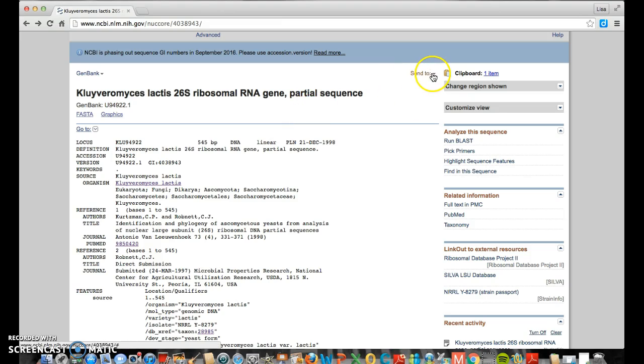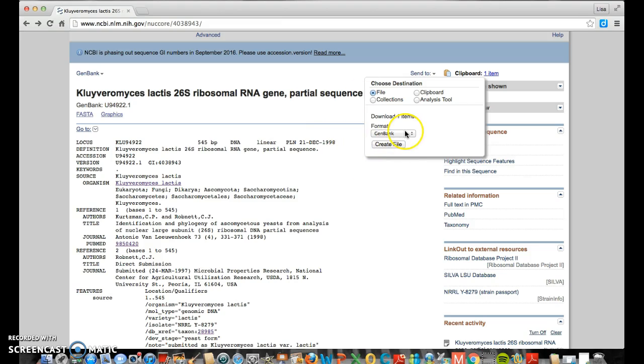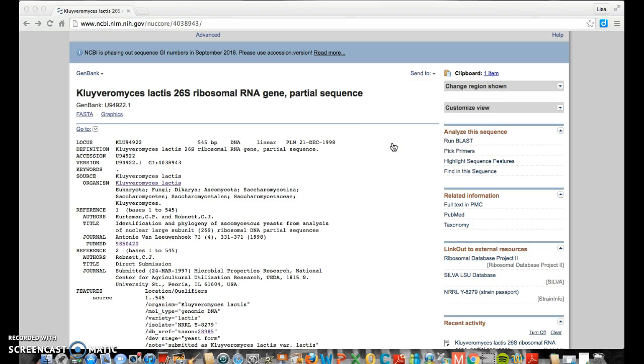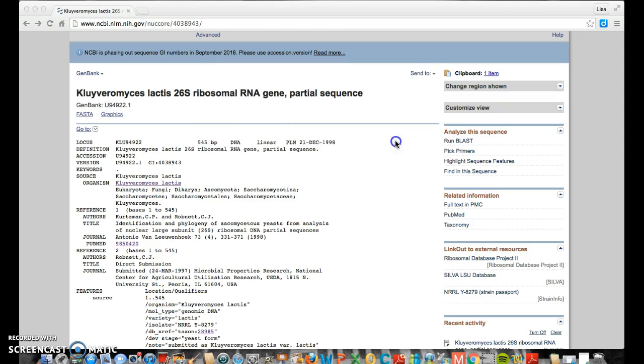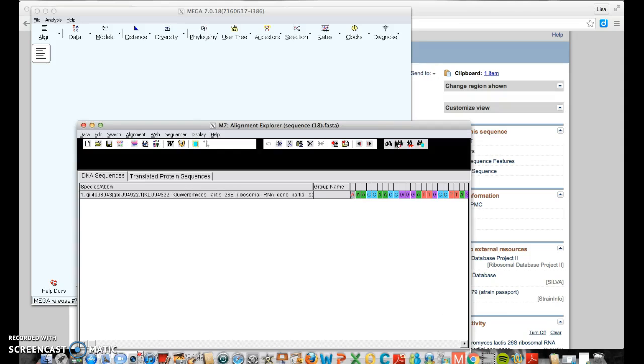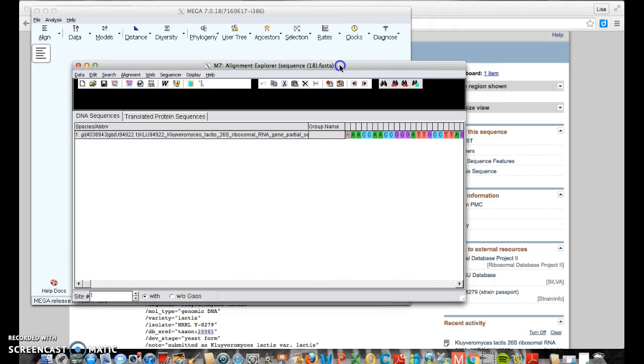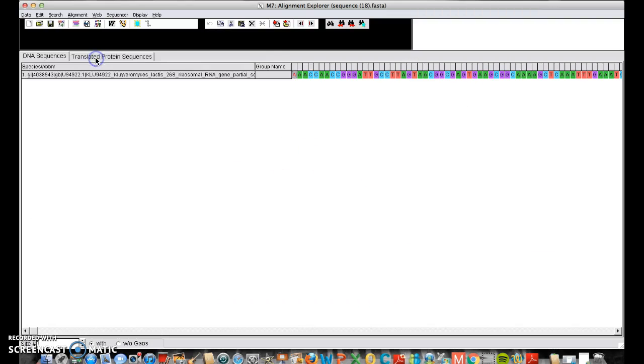And what I'm going to show you is you can send the whole file over to Mega, and we can play with it in Mega and do some manipulations. So the format is a GenBank, but we have to change it to FASTA. And yes, that's how it's pronounced, FASTA. Create a file, and right away I get a notification. It wants to open up Mega. Mega's been downloaded from the internet, are you sure? Yep, I am sure. I'm going to open it up. And ta-da! I have Kluyveromyces lactis, K-lactis, loaded. I'll make this a little larger for you.